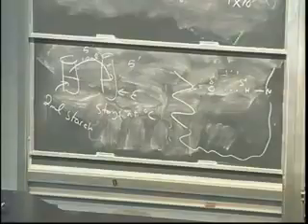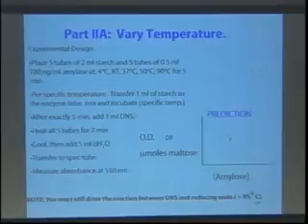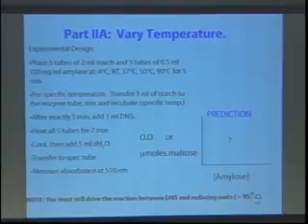Is that clear? So for this part, for the temperature, you have to equilibrate the 2 tubes at the different ones. You let them react for 5 minutes in that environment. You add the DNS, and then you do have to heat all the tubes again for the 7 minutes or so to drive the reaction of the DNS with the reducing unit. Does that make sense? Yes or no? Yeah? That's another mistake that's made, is the students don't heat those tubes because they already did something with the temperature. So make sure you heat it, okay? And you have to heat the blank as well, because you have to take into account the background.